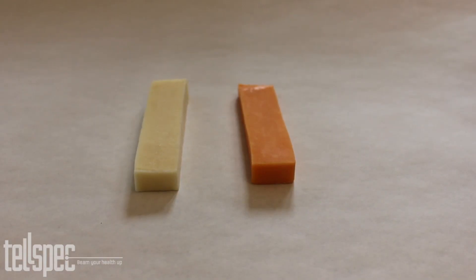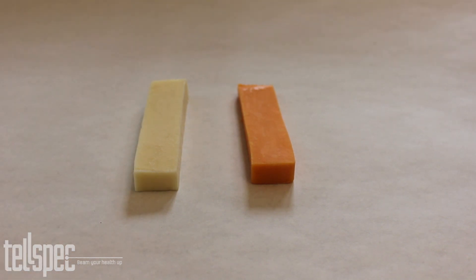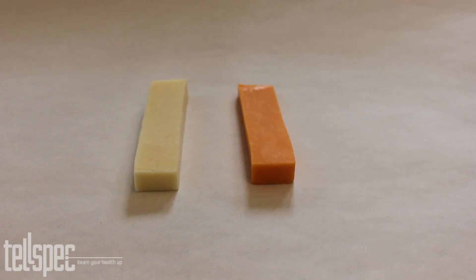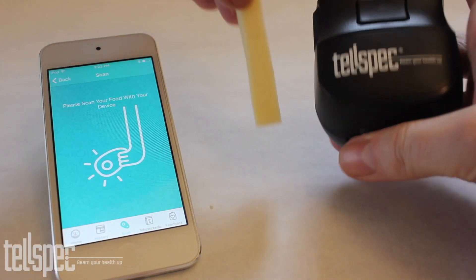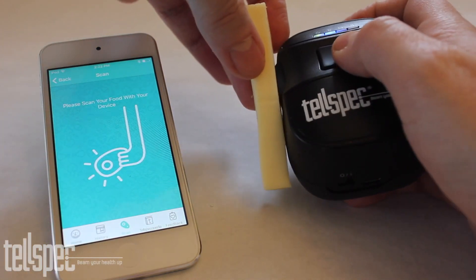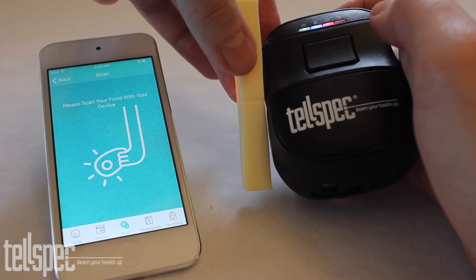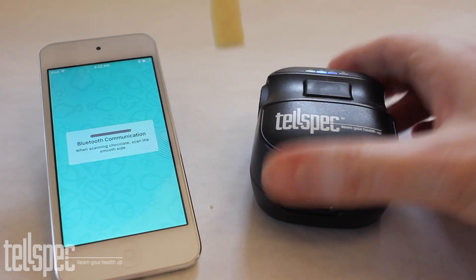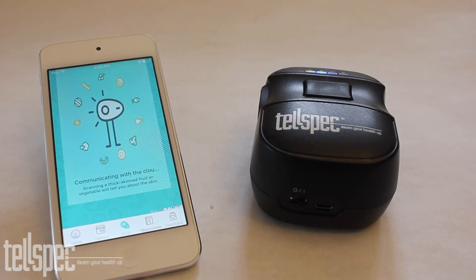Let's start by scanning some cheese. On the left we have some mozzarella and on the right we have some cheddar. First we are going to scan the mozzarella. We press the scan button and wait for the scanner to do the scan. When the scan is finished the information goes across to the phone, from the phone up to the cloud to be analysed, and the result comes back on the user's phone.